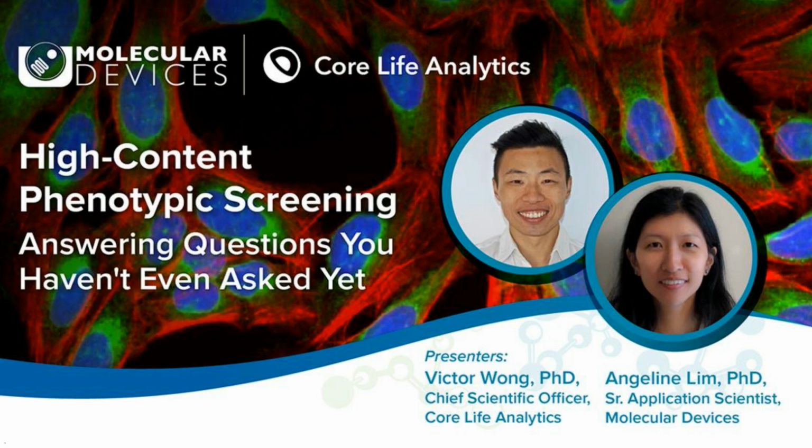All right, thank you. And it looks like we have time for one more question. In addition to the dyes you mentioned, is the cell painting protocol amenable and compatible with additional markers of interest, say SOX9? If I want to isolate specific SOX9 positive or SOX9 negative cell populations and compare between the two.